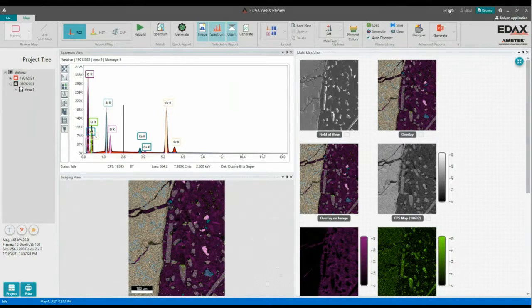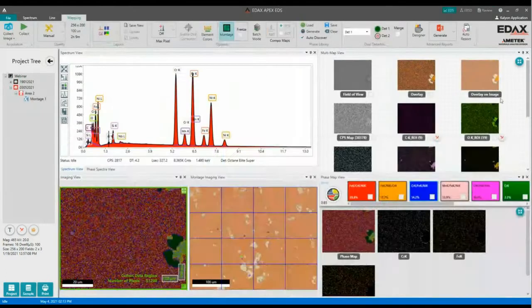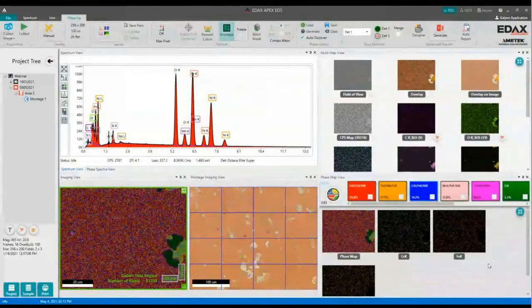Here you can see the user interface of the software. It is clear and well structured, and it is not too overloaded. This structure of the surface is an intuitive working place where no larger previous knowledge is needed.